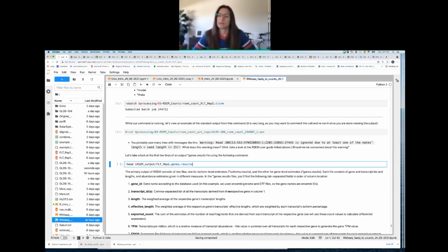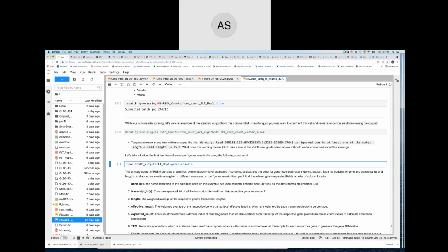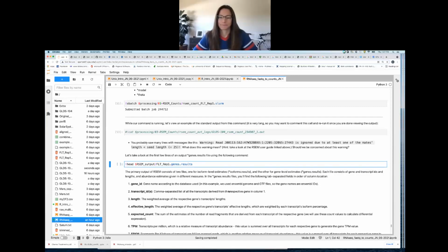So if all the 25 length reads are on one gene, an extreme example, then this might affect your analysis. But if they're distributed over the genome. Got you. Great question. Is there a way to check that?